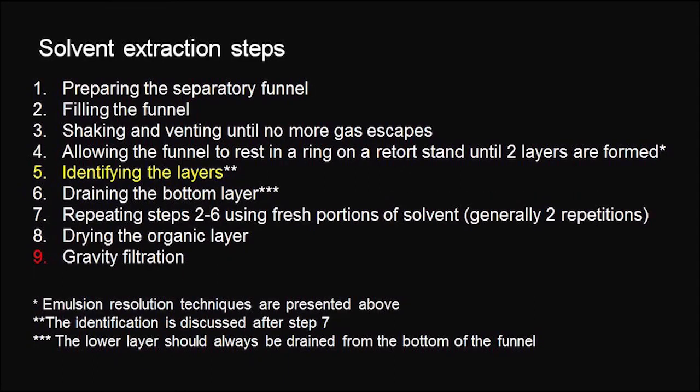Once the drying task is complete, the desiccant should be removed by gravity filtration.